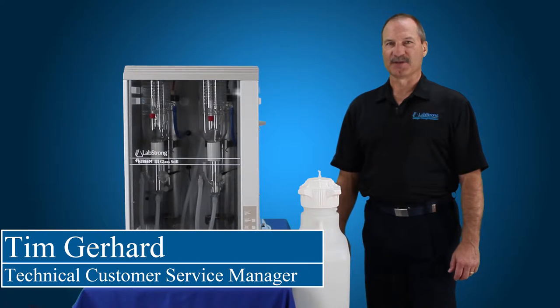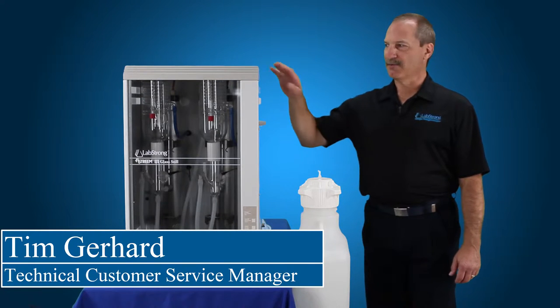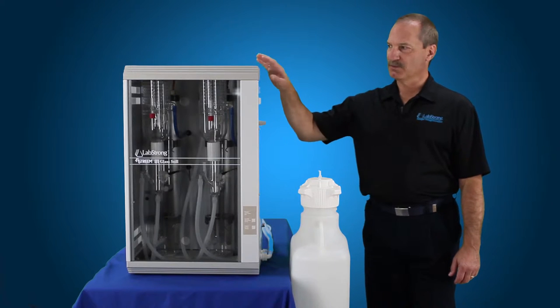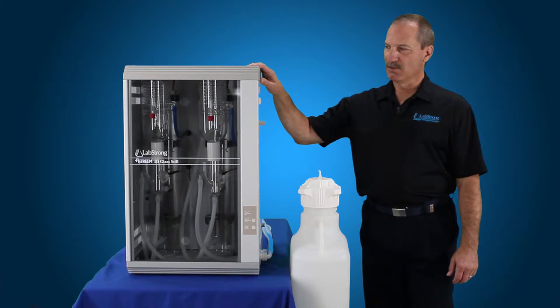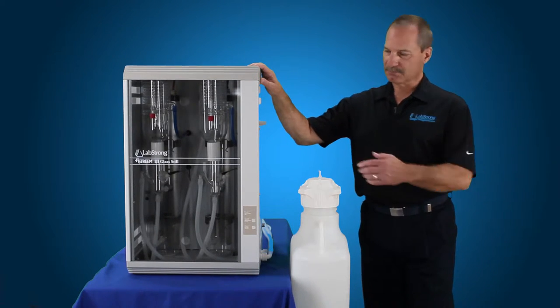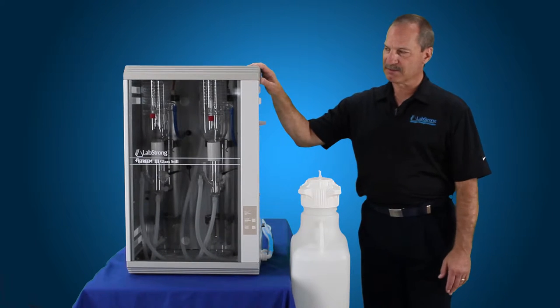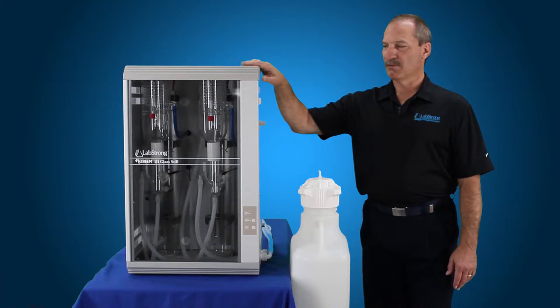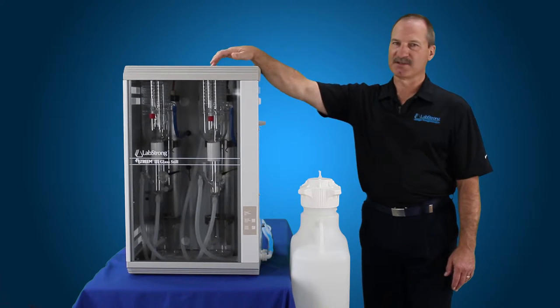Hello, my name is Tim Gerhardt, I'm from LabStrong. Today we're going to learn how to connect a Fi-Streem III to a 20-liter tank. In this case we've got a Fi-Streem III, which is an 8-liter-per-hour system, or the 4-liter bi-distiller — it's going to be the same size — or the Fi-Streem III, 4-liter-per-hour system, which is about half the size.